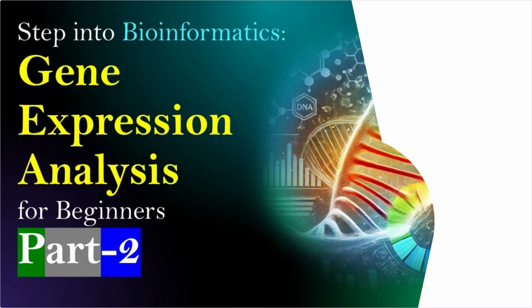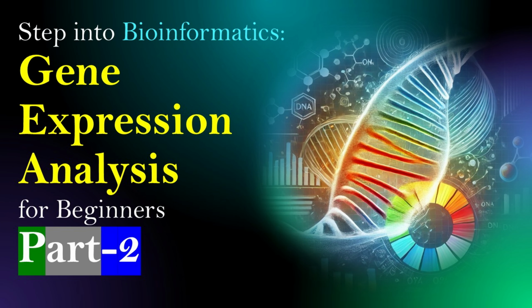Have you ever wondered how scientists transform the raw gene expression data into meaningful biological insights? In this session, I will show you exactly how to do that.